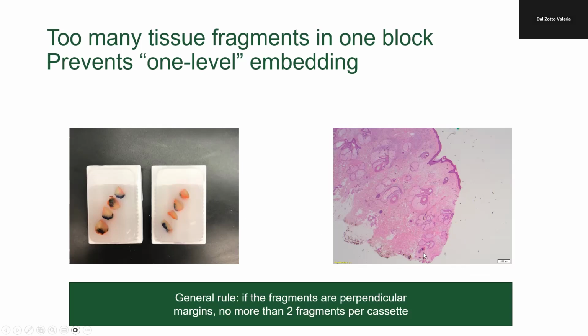For example, this is the result. Because they are not embedded at the same level, you are not going to have exactly the margin. Here the section lacks a portion of the tissue. It's an important portion because it's the margin of the lesion.